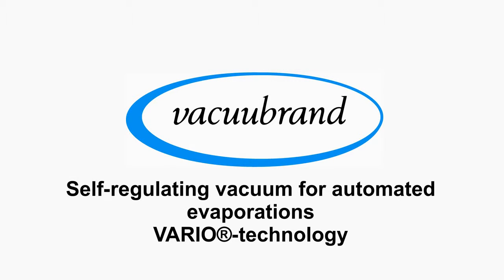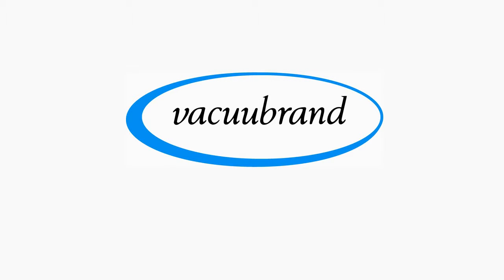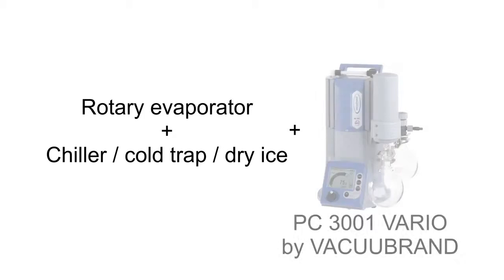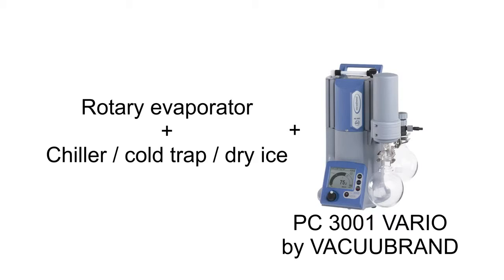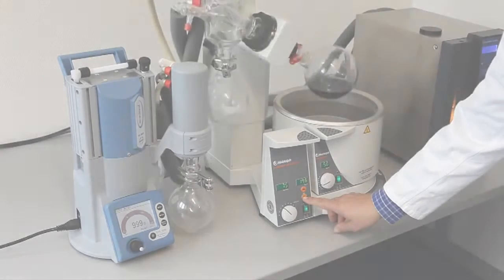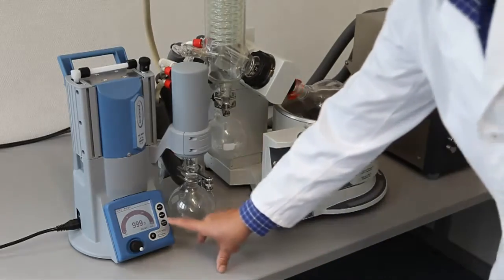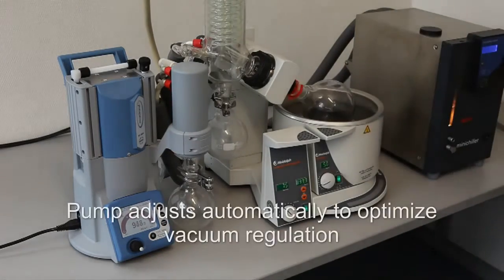Vacu-Brand Vario Technology: PC-3001 Vario in use with rotary evaporation. Setting of bath temperature and rotational speed. At the touch of a button, the process starts.